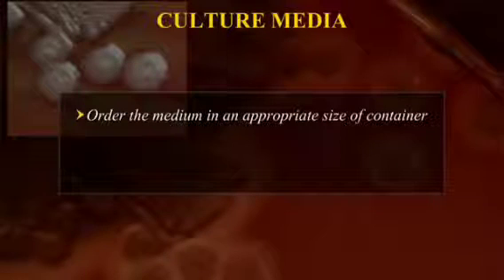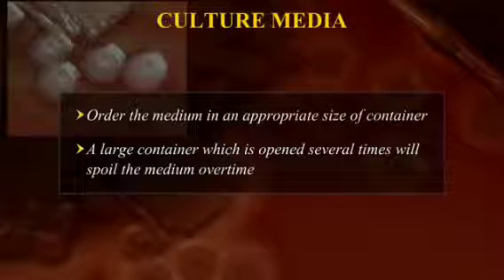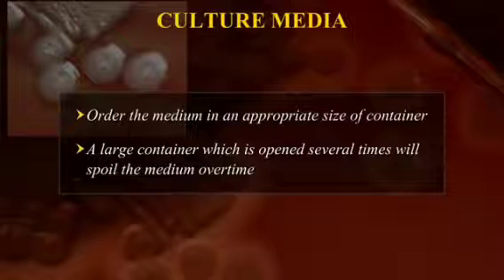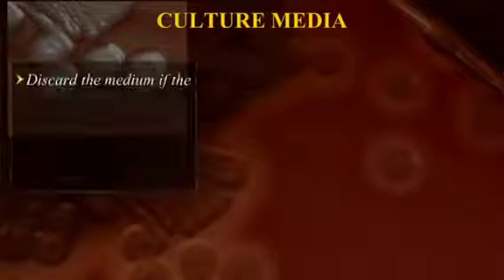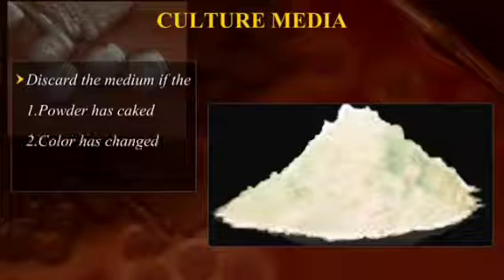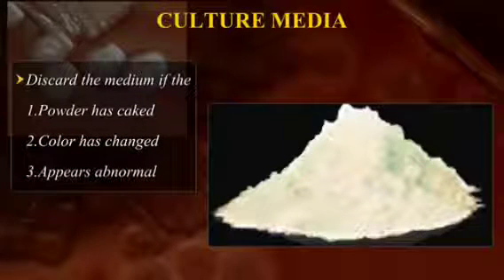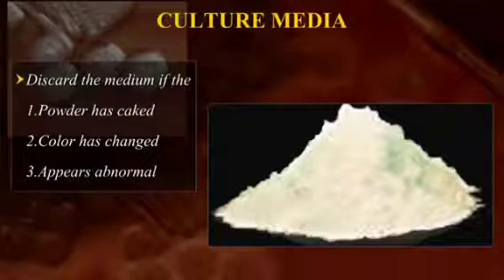Order the medium in an appropriate size of container and according to the need of your laboratory. A large container which is opened several times will spoil the medium over time. Discard the medium if the powder has caked, if the color has changed, or if it appears abnormal in any way.